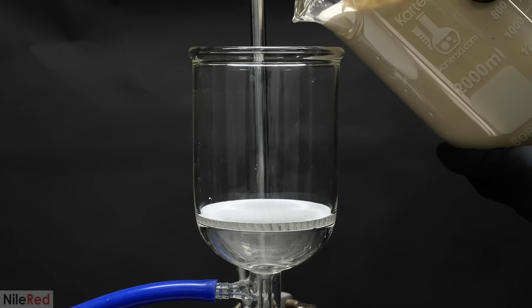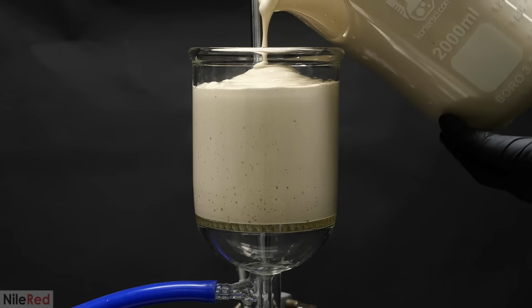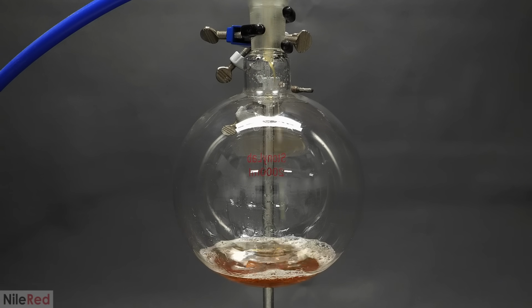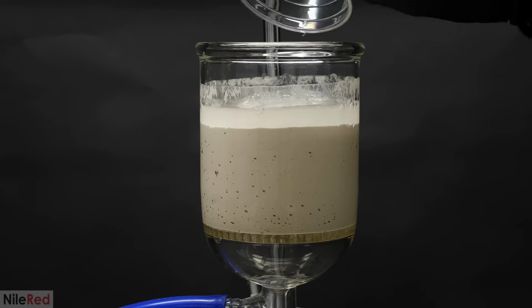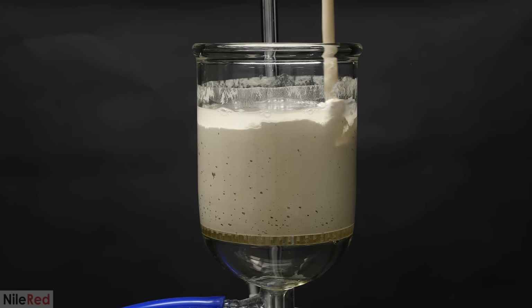I poured in as much as I could into the filter, but it wasn't even close to fitting everything. I was only able to add what looked like half of it, and I was gonna have to do this in 2 batches. After loading up as much as I could, I turned on the vacuum and I started pulling out the water. This was all being drained into a flask below the filter, and I was getting some nice and clear, dark liquid. When the stuff in the filter looked dry, I added some water. I then mixed it around, and I was doing this to wash out any sugar that might have been stuck in the calcium sulfate.